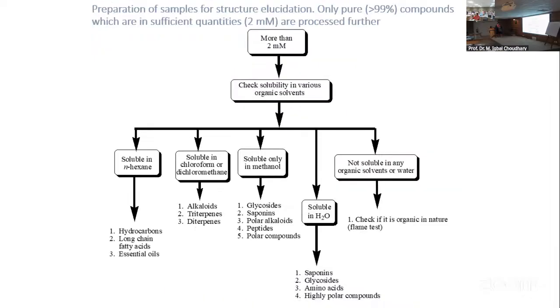Highly polar compound. And if your compound is not soluble in any solvent or water, then you have to check if your compound is organic in nature or not. You might need to do different types of flame tests, etc. Right?